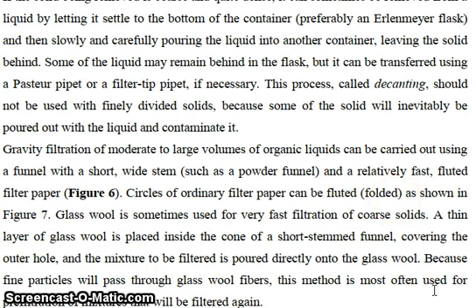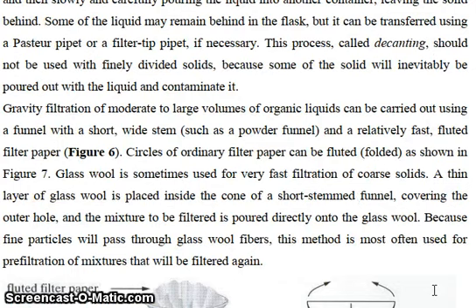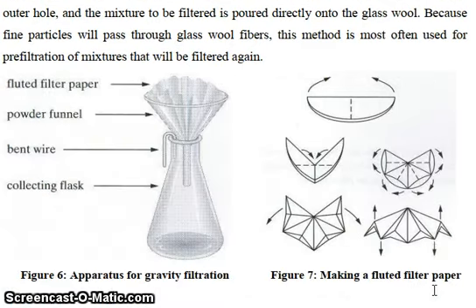A thin layer of glass wool is placed inside the cone of the short stemmed funnel to cover the outer hole, and the mixture to be filtered is poured directly onto the glass wool. Because fine particles will pass through the glass wool fibers, this method is often used for pre-filtration of mixtures that will be filtered again. So friends, you can see here fluted filter paper, powder funnel, bent wire, and collecting flask, and this is the way you make fluted paper.